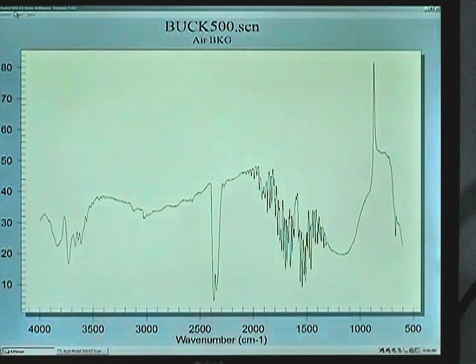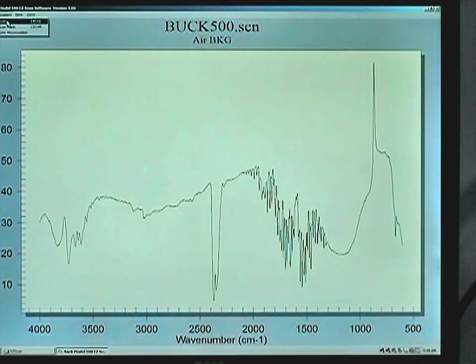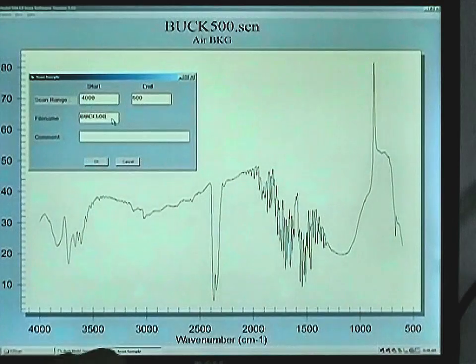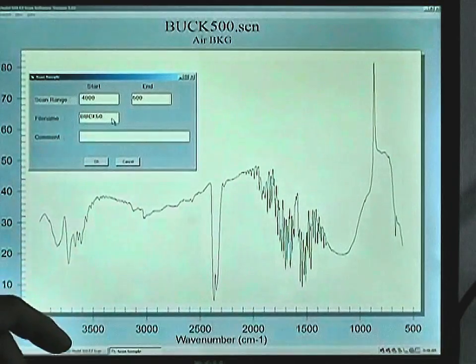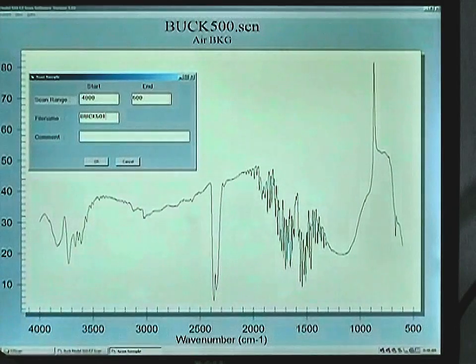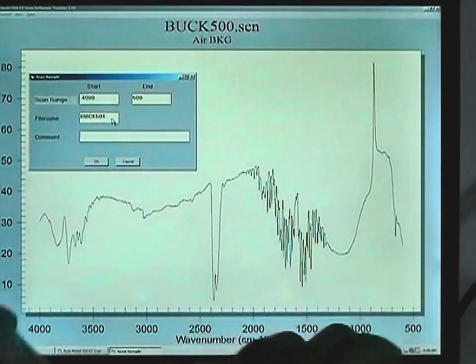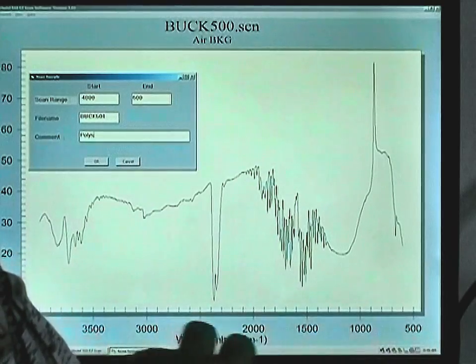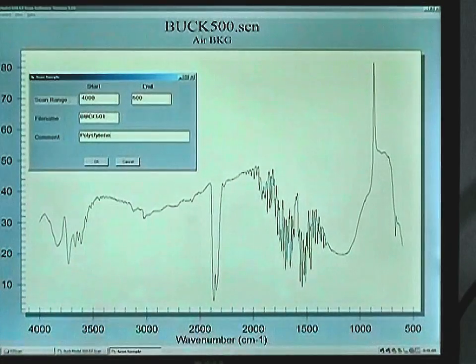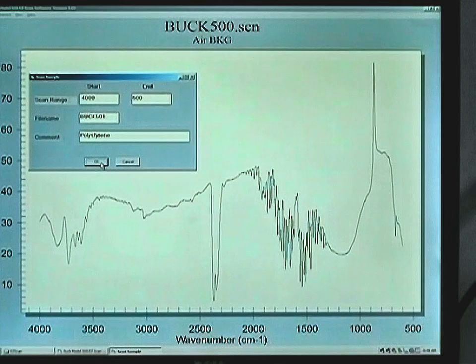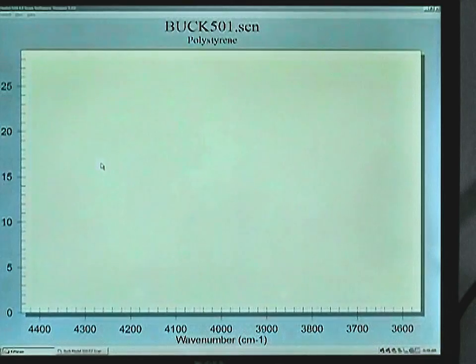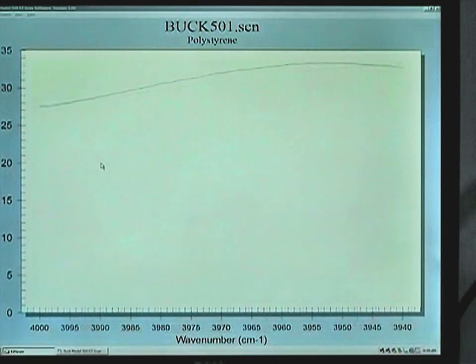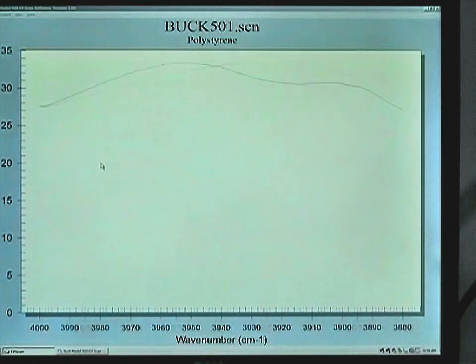Click on Instrument, Scan, and when the sample ID window comes up, change the file name to Buck 501 or another appropriate file name and put a comment in to identify the sample. Click OK. The system will reset itself and you will see the single beam spectrum of the polystyrene card being run.